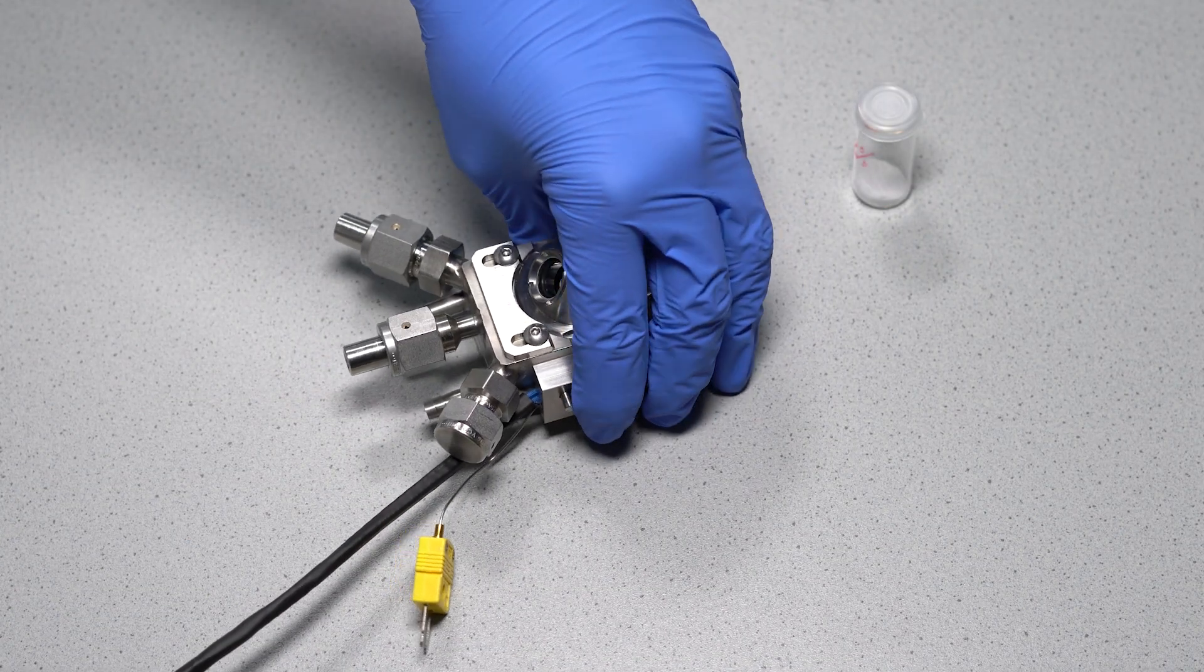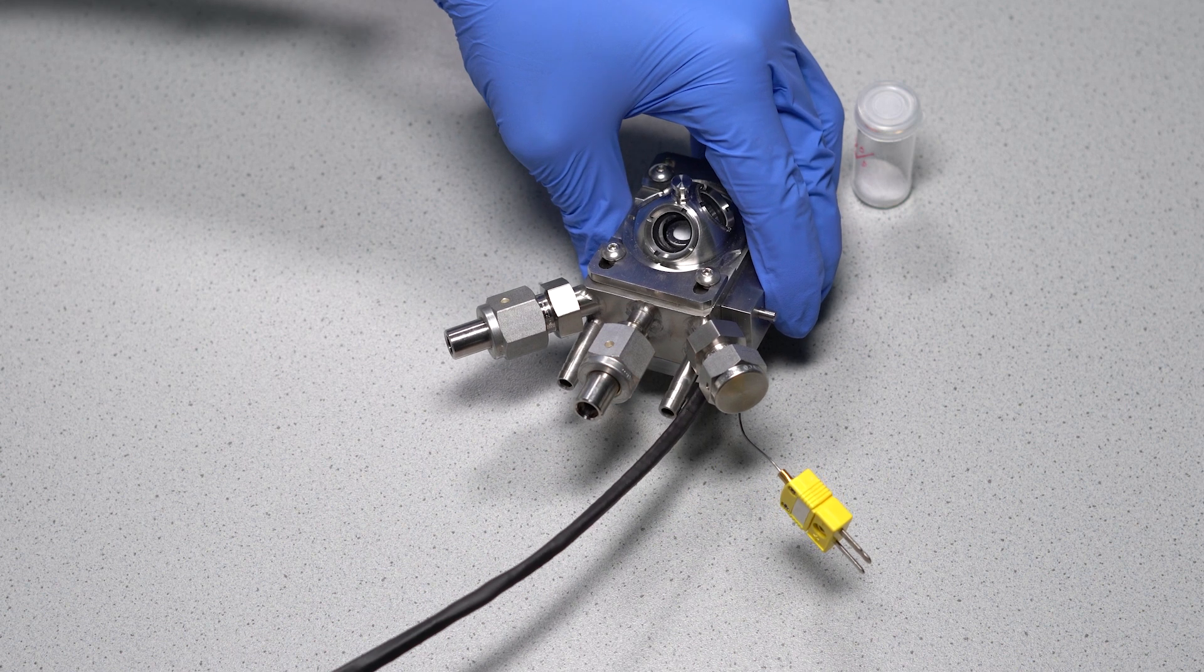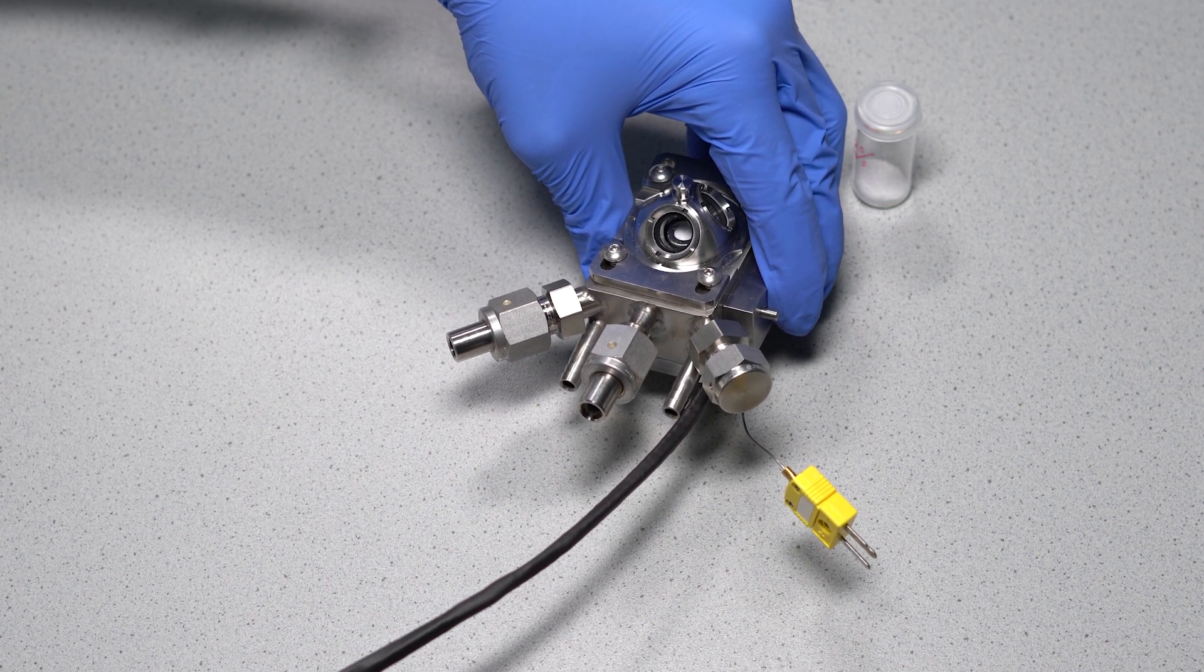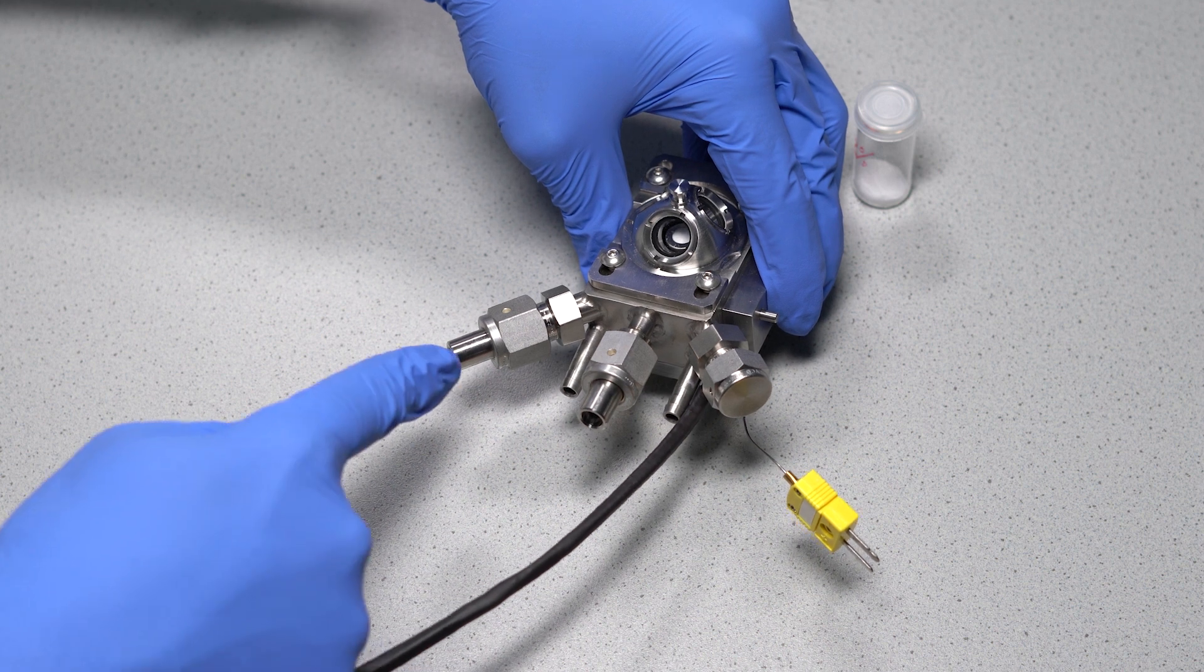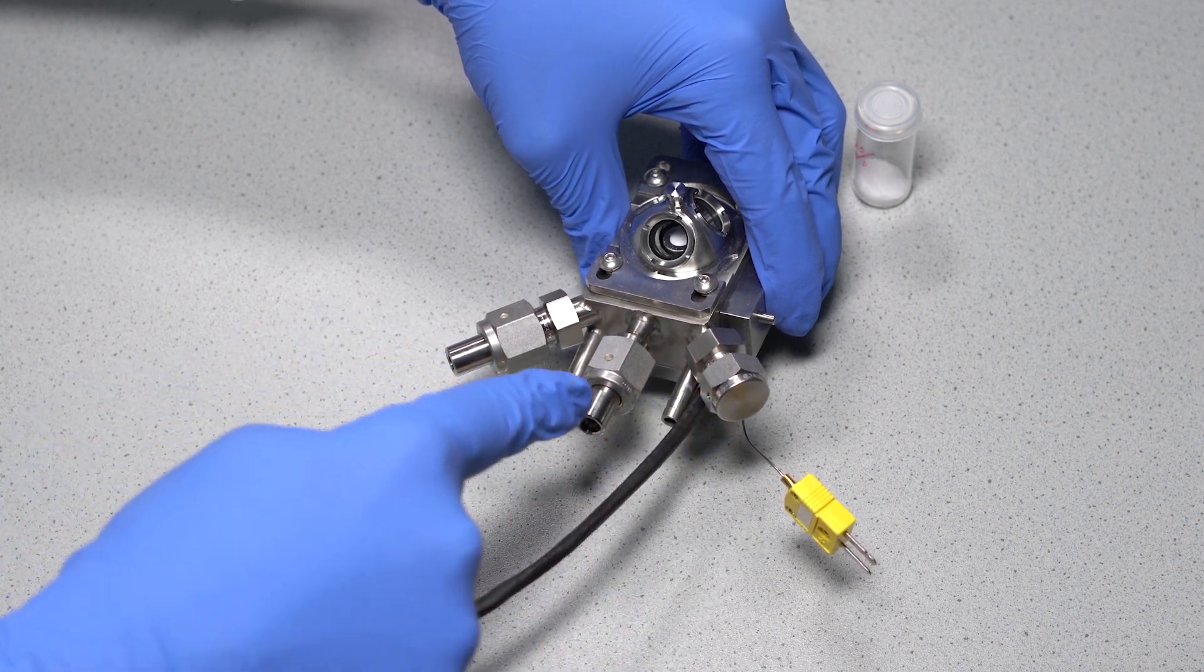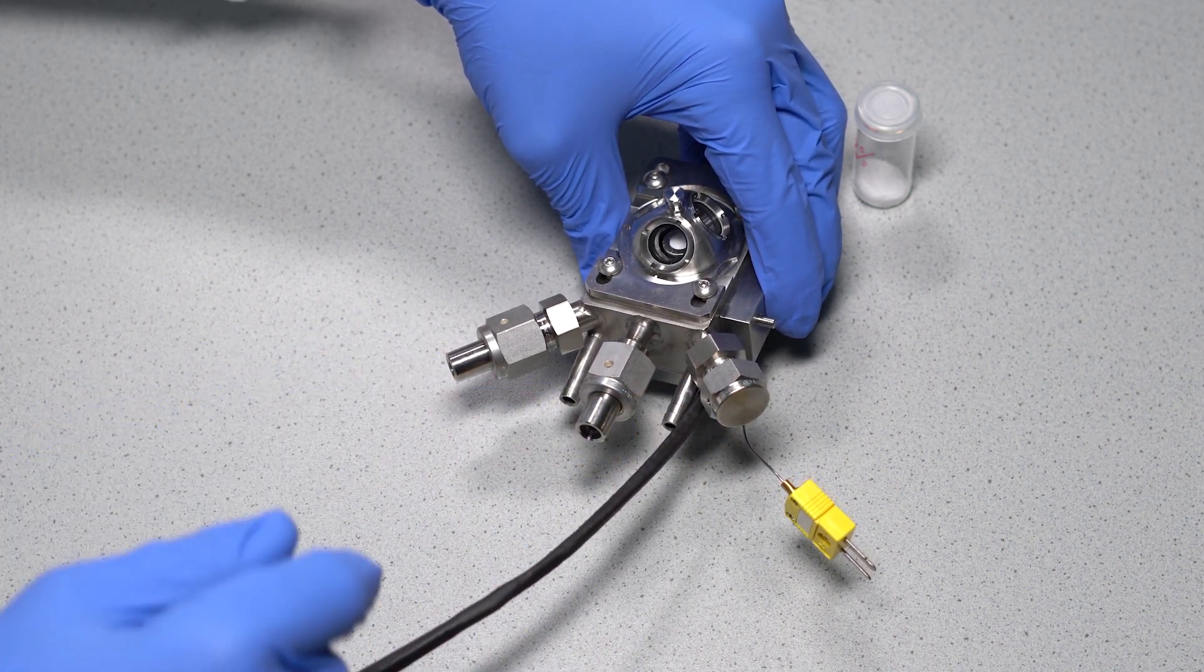If we want to study solid gas reactions, we need to add the reaction gases to the sample. And the Praying Mantis reaction chamber perfectly serves that purpose. These connections are used to supply gas to the sample or evacuate the cell.